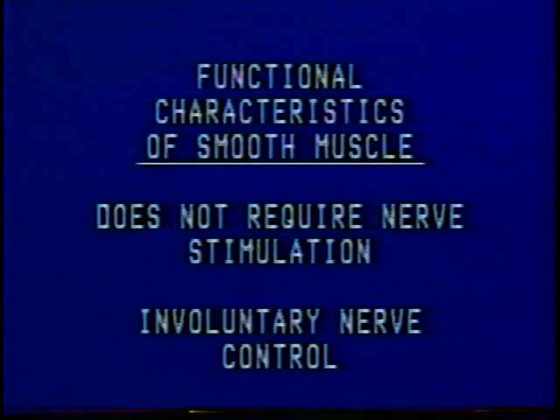Functionally, this tissue is like cardiac in that it does not require nerve stimulation for contraction, and hence is also considered an involuntary muscle.